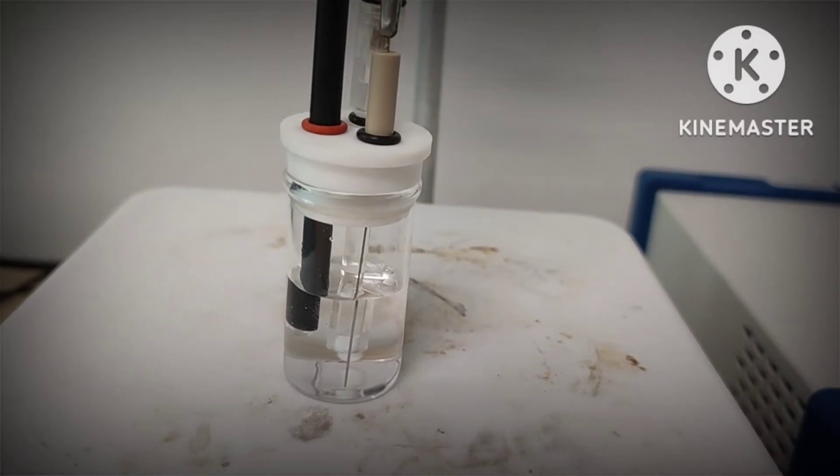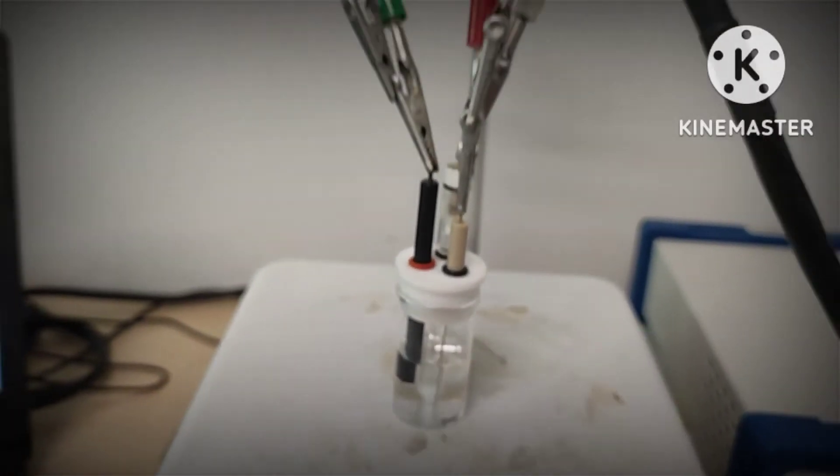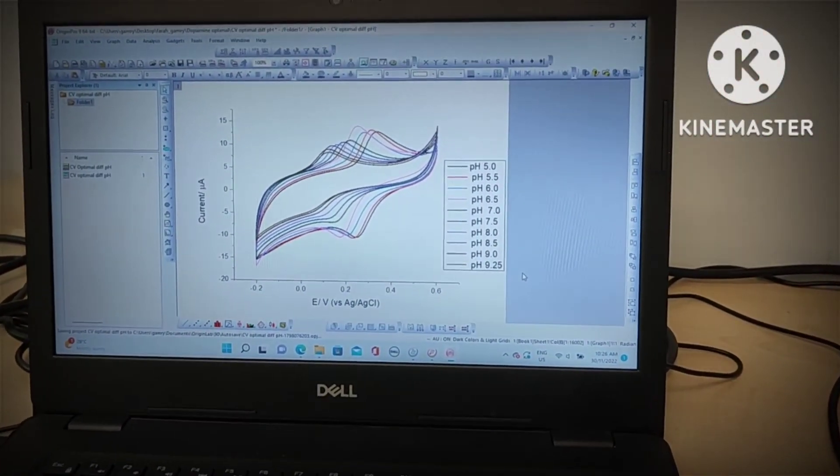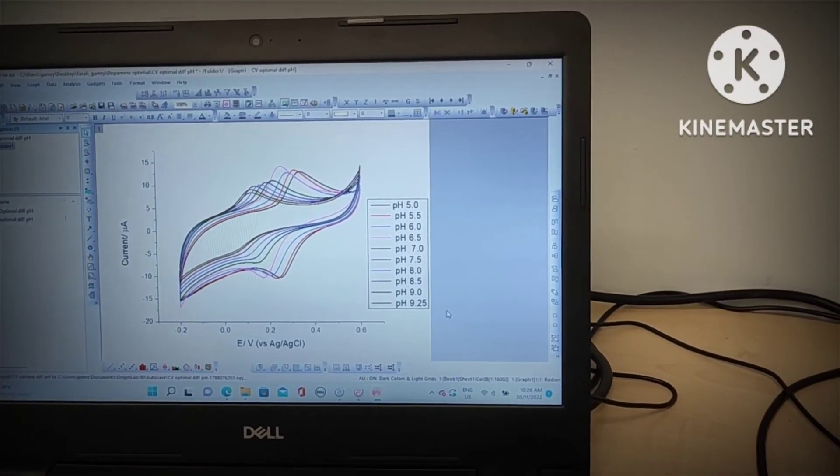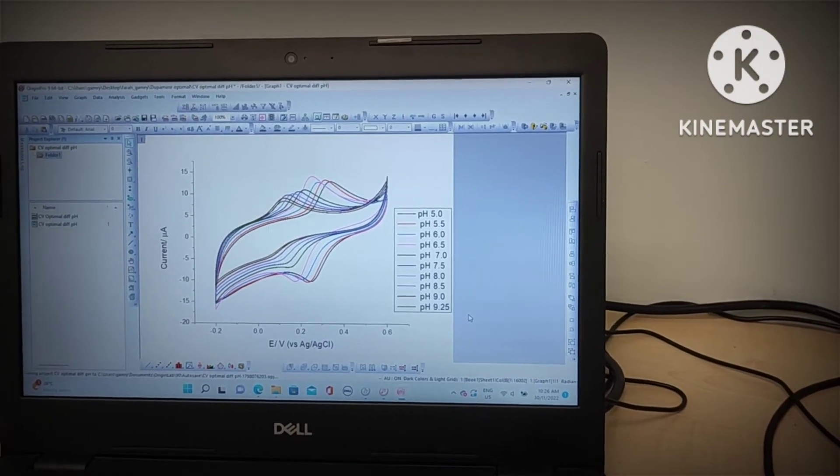Then you can do sensor analysis. As you can see here, she studies the difference in pH—which pH is suitable to detect the analyte, in this case to detect dopamine.